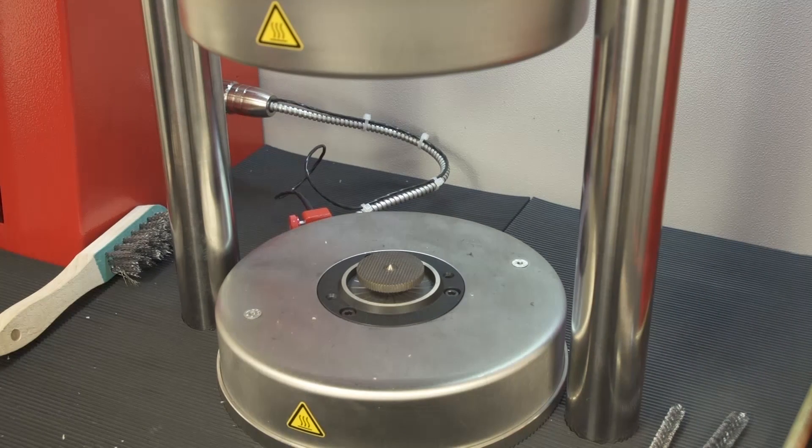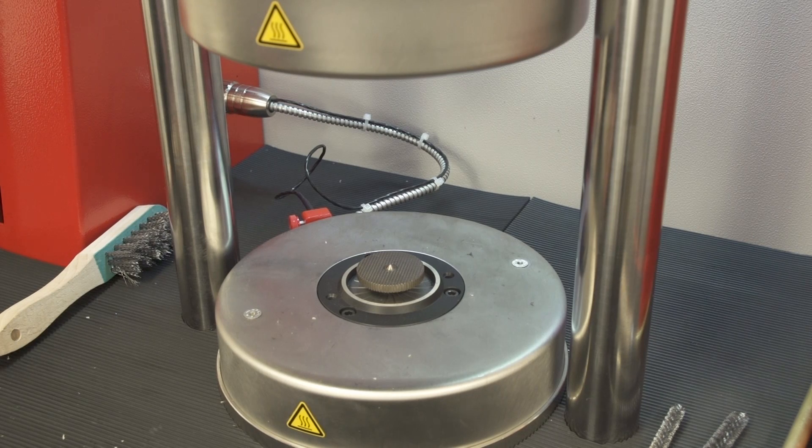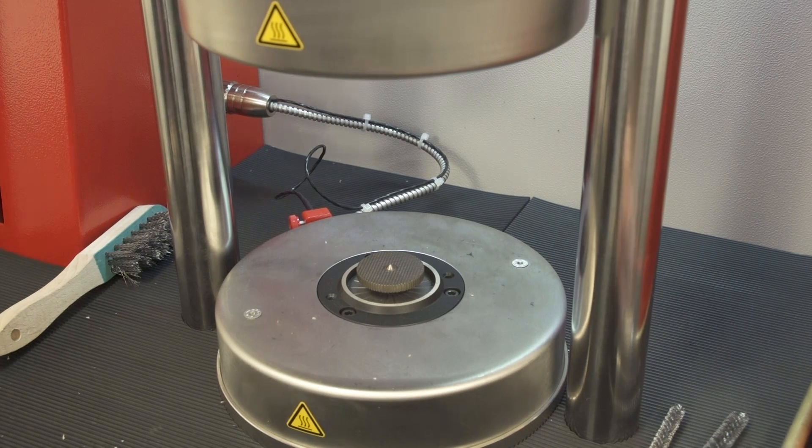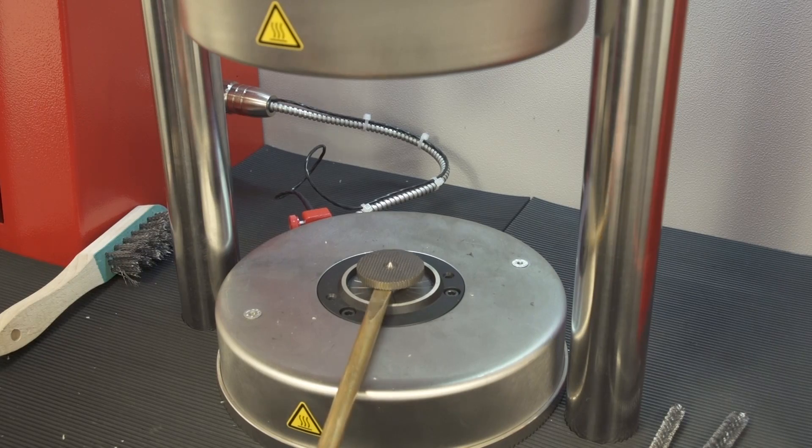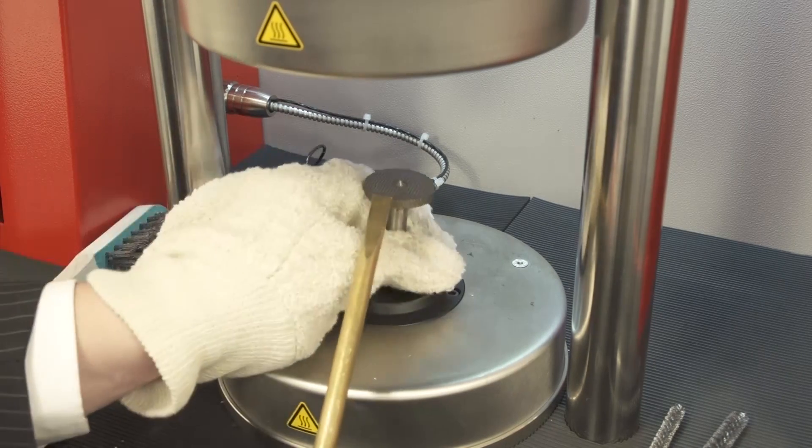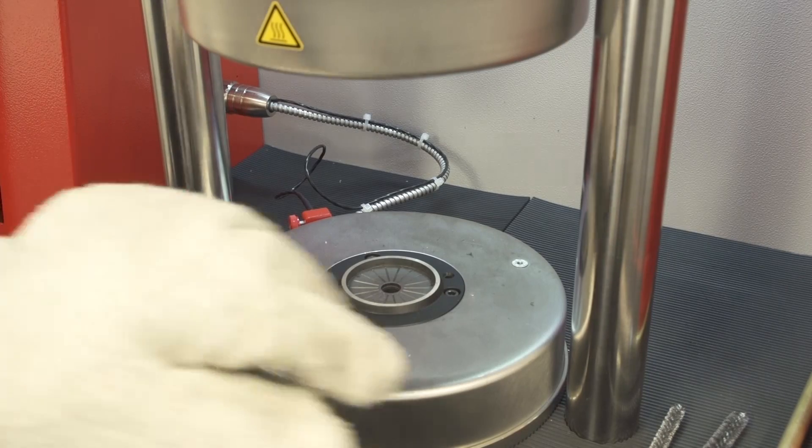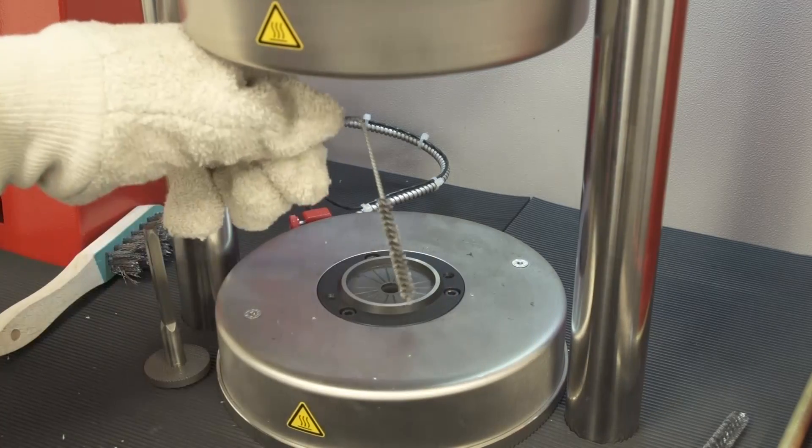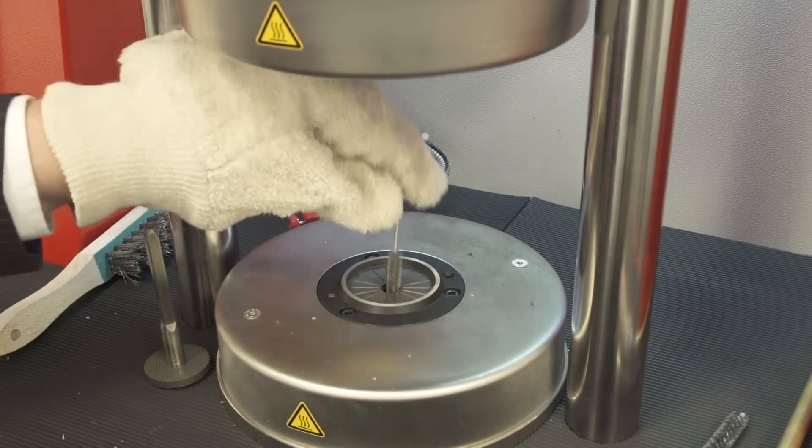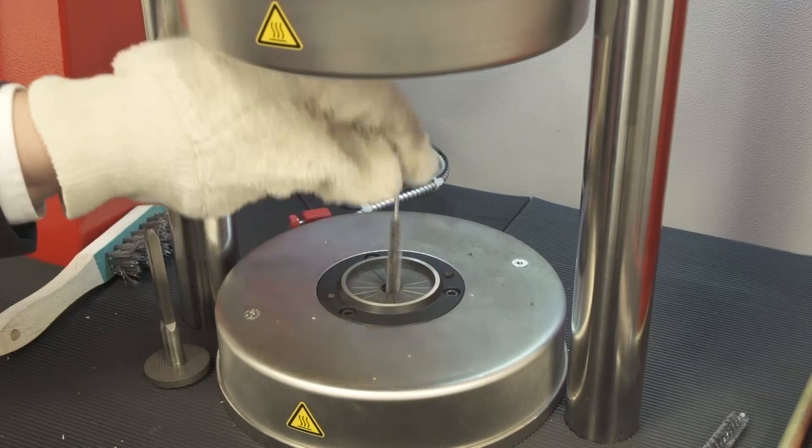From time to time, at least after every tenth test, a cleaning of the rotor shaft is recommended. Remove the rotor from the die and use the provided wire brushes to clean the rotor shaft and remove any material residue from the die area.